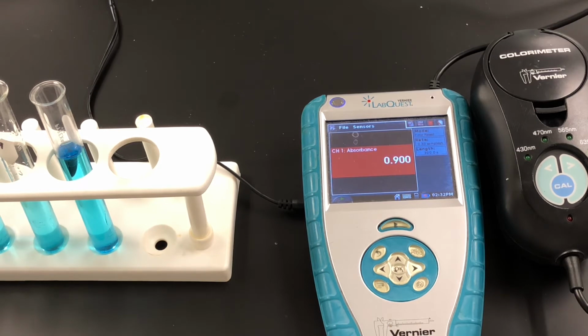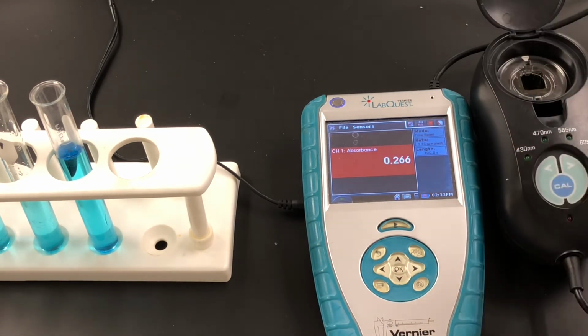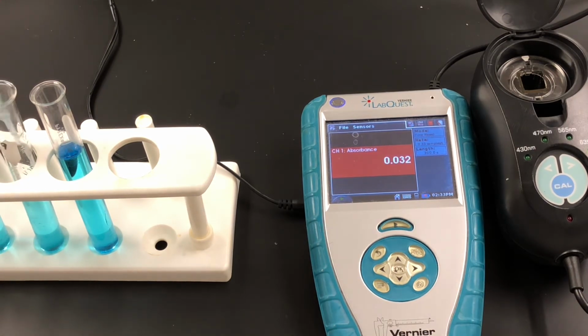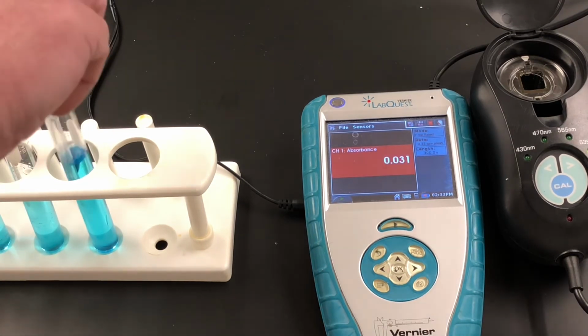This one's having a little trouble stabilizing here. And on to our last one. So I get a little bit, rinses out my pipette, and it rinses out the cuvette so that we know we have just this concentration in there.